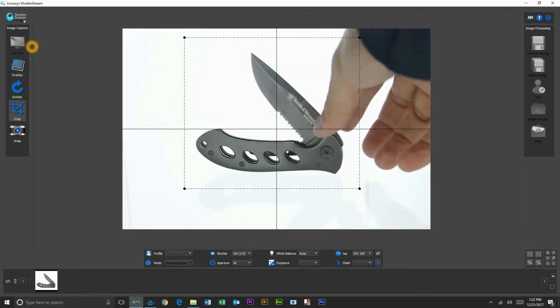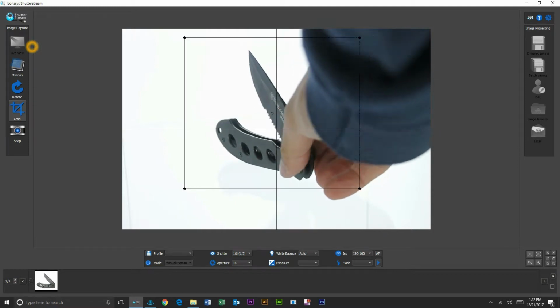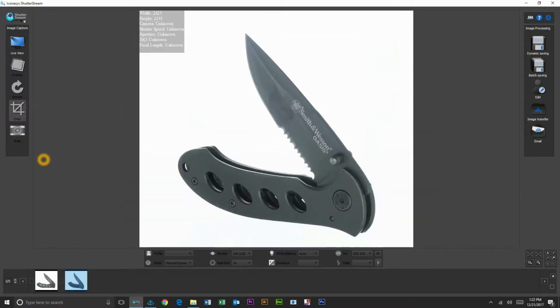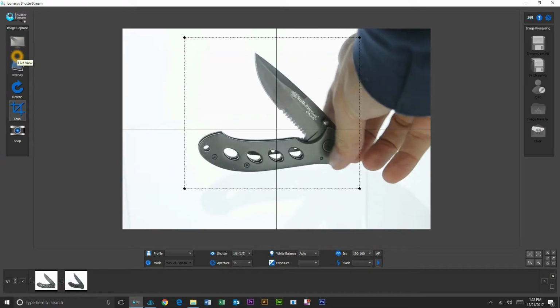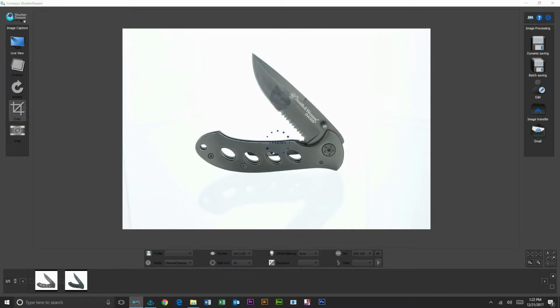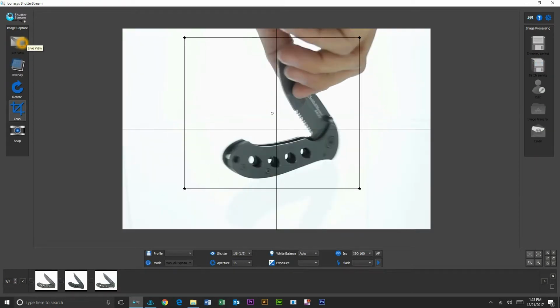So let's re-enable our live view, and maybe we want to show a few different angles. I've tried to mock up a little fingerprint on this blade here, just again for forensics purposes. So we're going to shoot maybe about 3 or 4 different images here. And just to communicate the speed of the workflow, we're getting consistent quality images for every single shot.